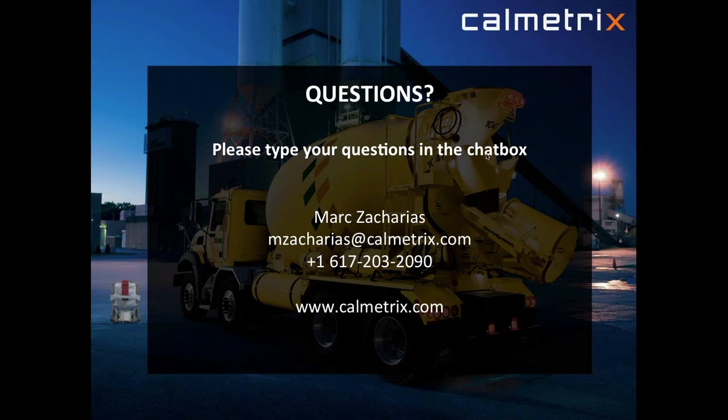Does the planetary movement eliminate or minimize plug flow? Yes, it actually does. The planetary movement combined with the shape of the impeller minimizes what is called plug flow. It minimizes any type of agglomeration of particles. It is as efficient as a normal mixer would be.